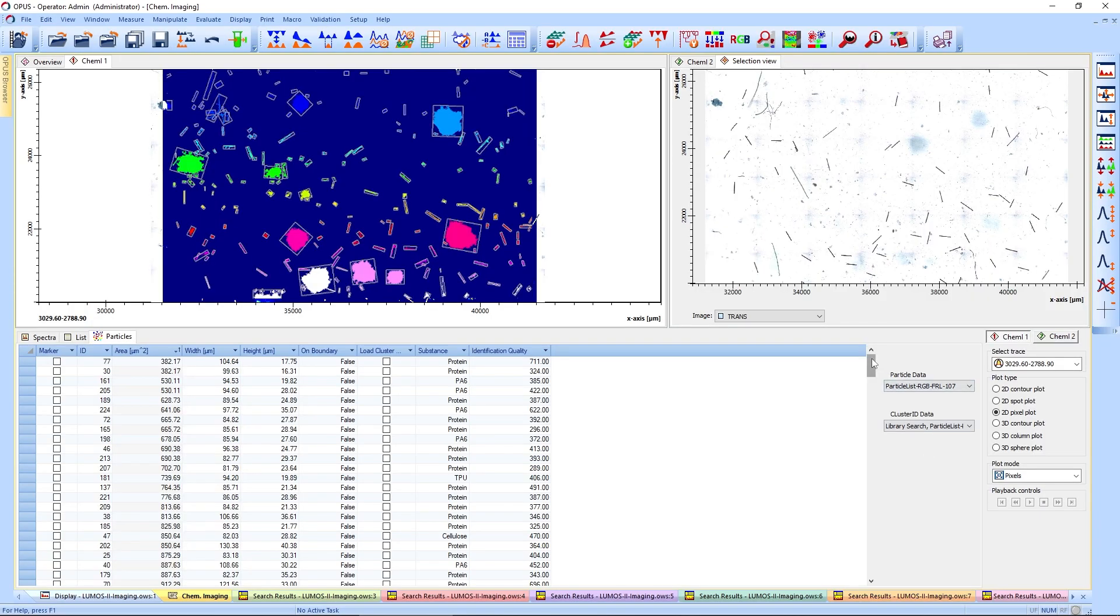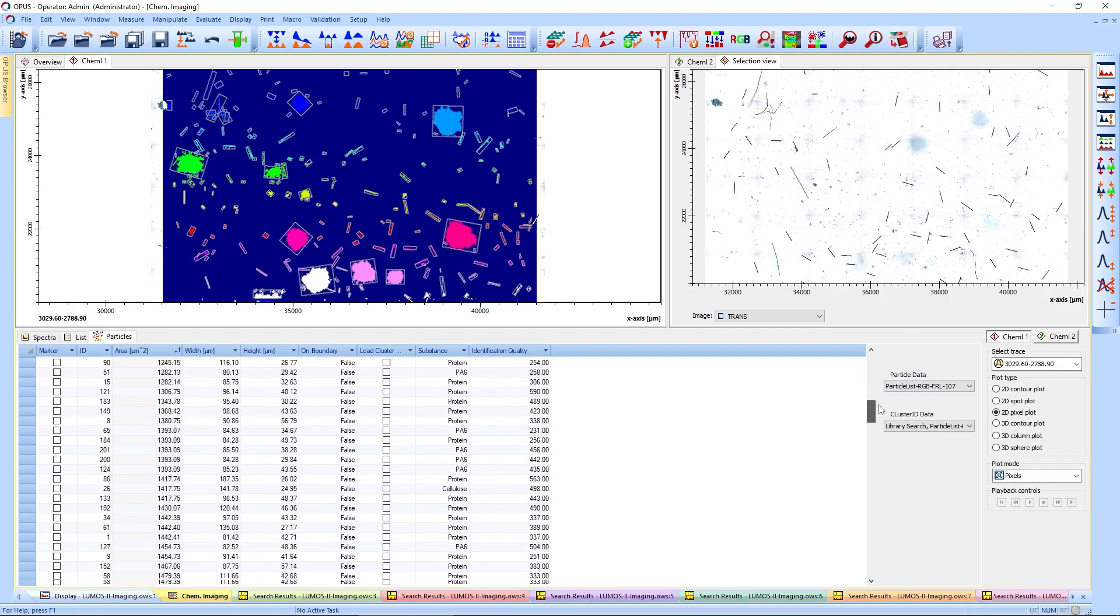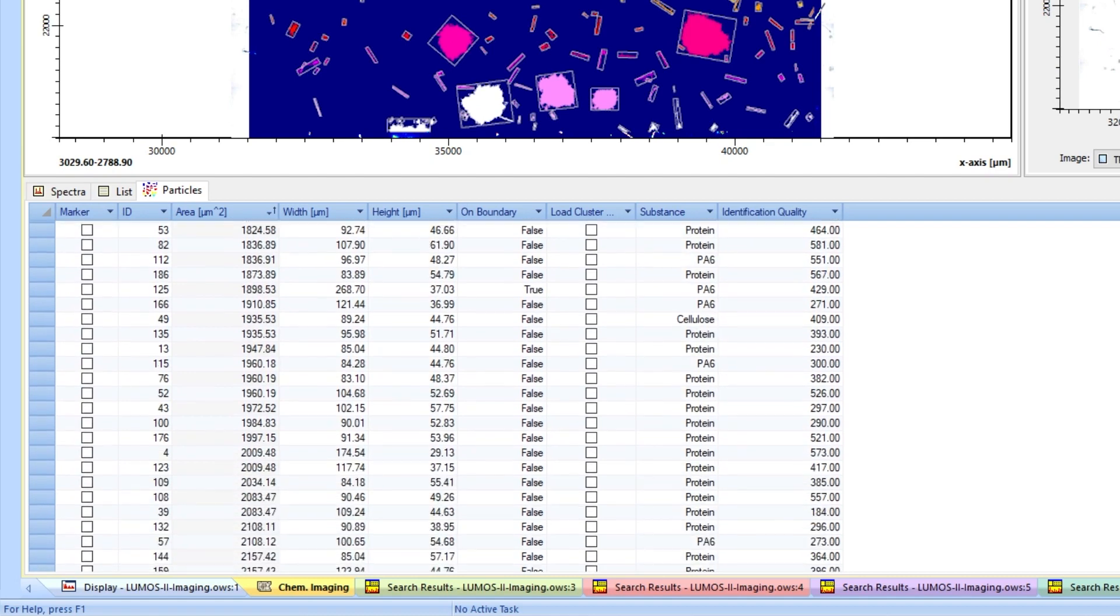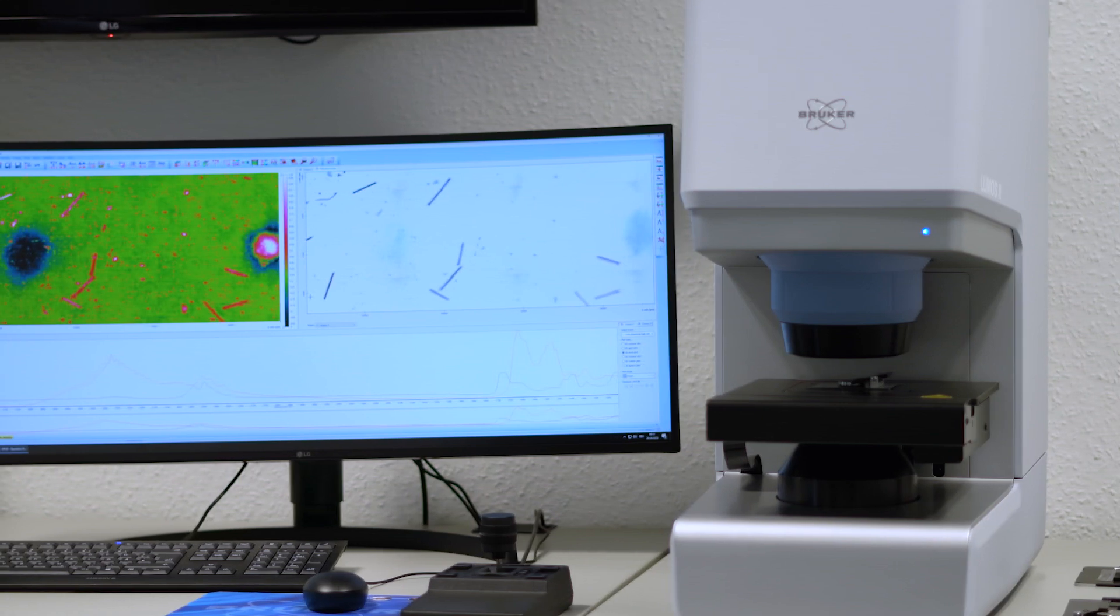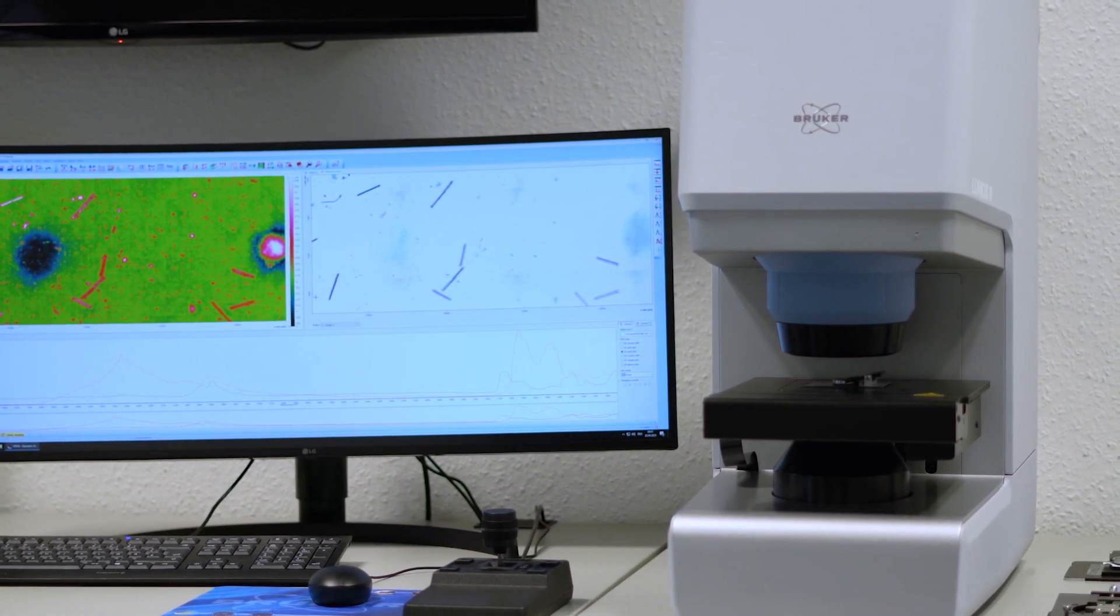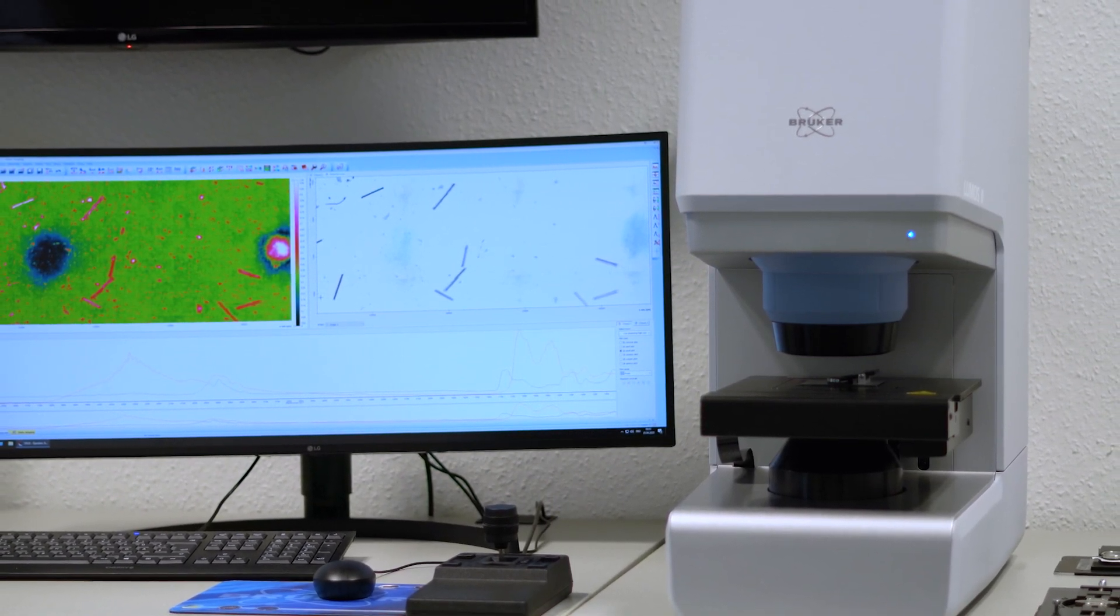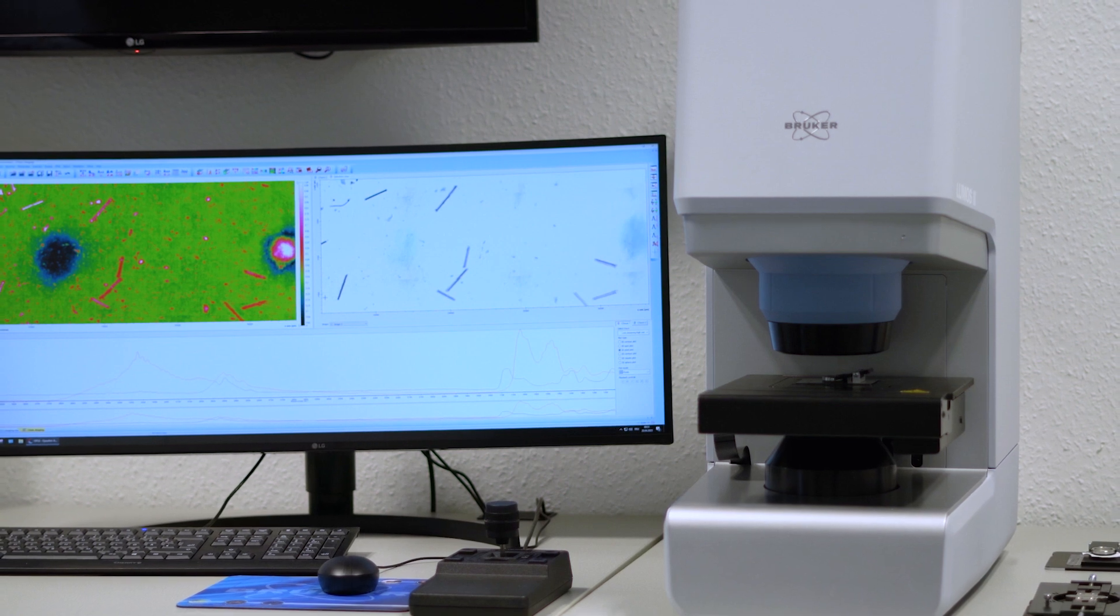In addition, we can also utilize the Find Particle function to create a list of the particles, this time based on the FTIR image. Fortunately, this was just a trial sample created to benchmark the Lumos 2 and not a real-life injectable solution.